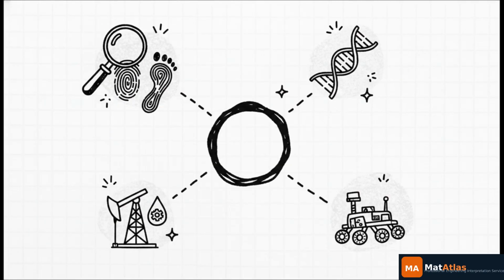And that fundamental difference brilliantly illustrates why this tech is such a game changer. Because we are quite literally weighing molecules, the applications are just practically endless. It's an indispensable tool for identifying unknown forensic substances at crime scenes, sequencing incredibly complex biomolecules in medical research, and analyzing the intricate, messy makeup of crude oils. The technology has even been miniaturized for space missions so we can analyze extraterrestrial atmospheres. It essentially gives us the precise molecular recipe of, well, almost anything.